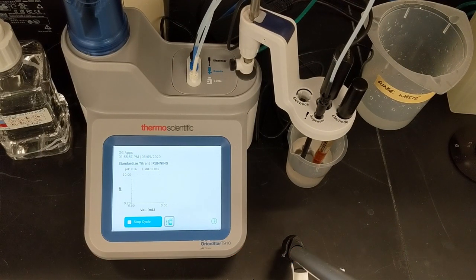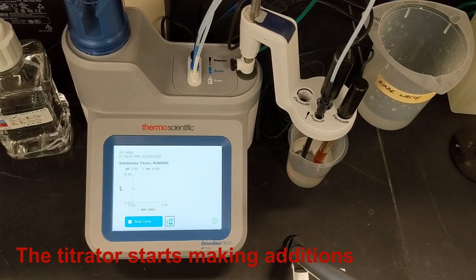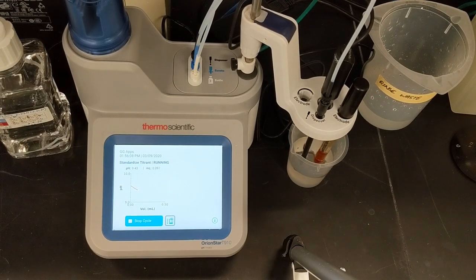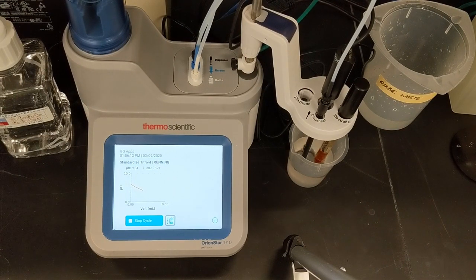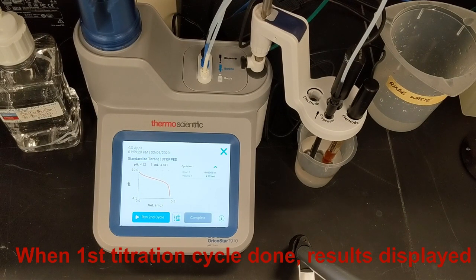Then the titrator begins to make automatic additions of titrant, which I can see happening in the live display screen. Titrant is added, the pH is sensed, and the process continues automatically until the titrator senses the endpoint and ends the titration. Here I can see that the inflection of the titration curve has started and the endpoint is near.